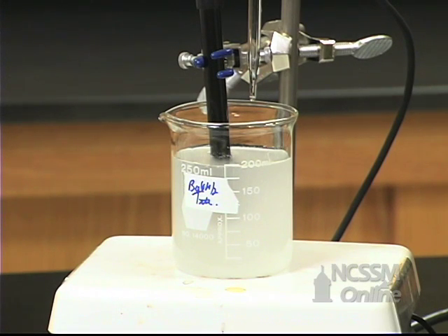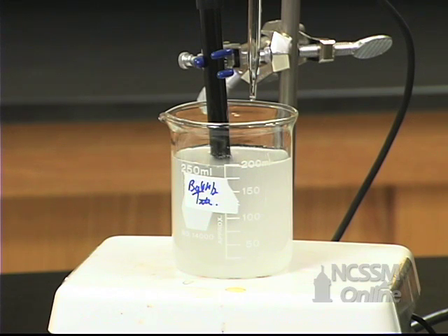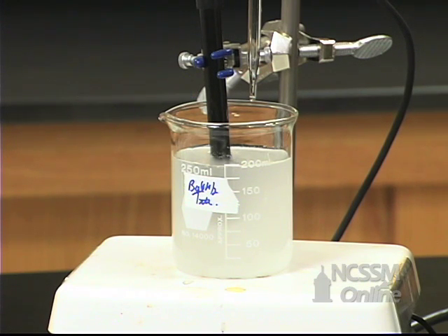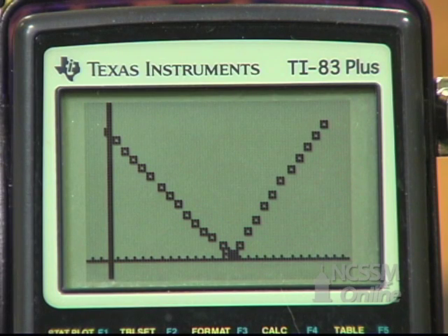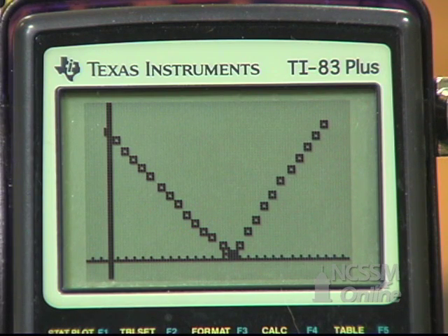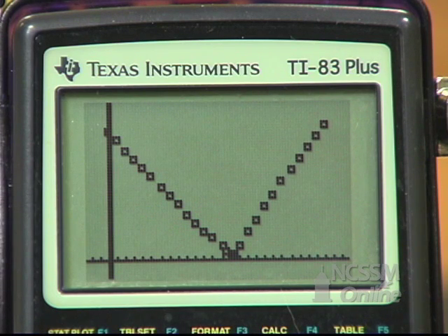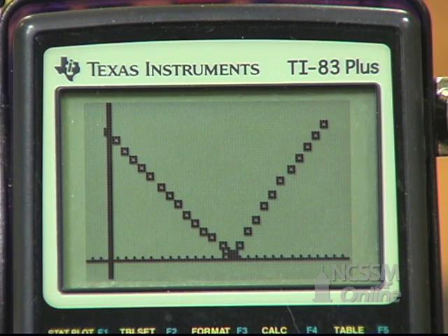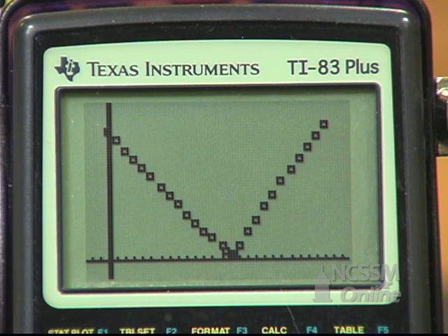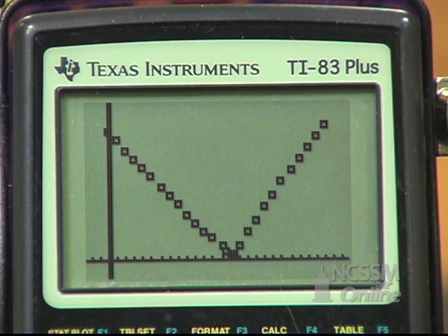As the sulfuric acid reacts with the barium hydroxide, very slightly soluble barium sulfate is formed — you'll see this as a white precipitate in the beaker. The conductivity of the solution decreases until you reach the point where you have the same number of moles of sulfuric acid as barium hydroxide, then increases due to excess sulfuric acid. You will use the intersect program to find the point of minimal conductivity; at that point, the moles of barium hydroxide equals the moles of sulfuric acid, and knowing the concentration of the sulfuric acid, you can solve for the concentration of the barium hydroxide.